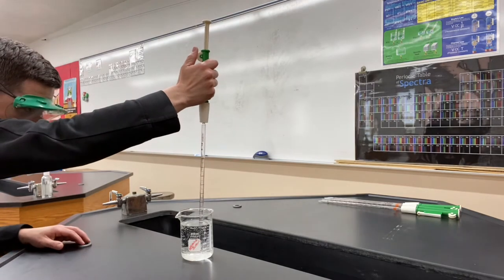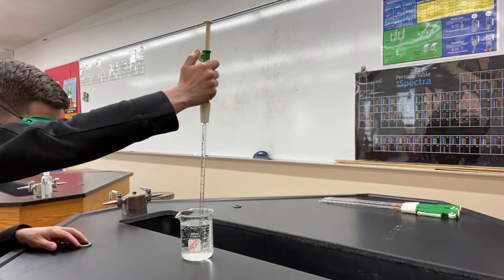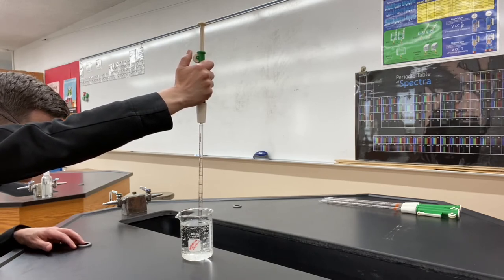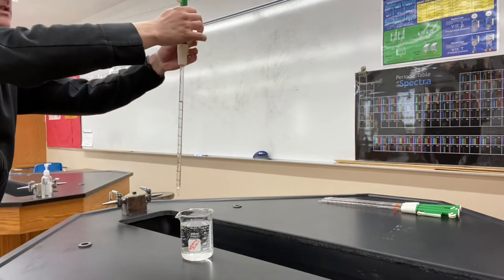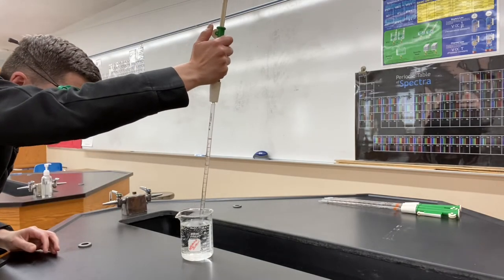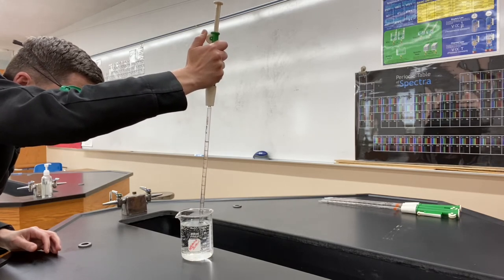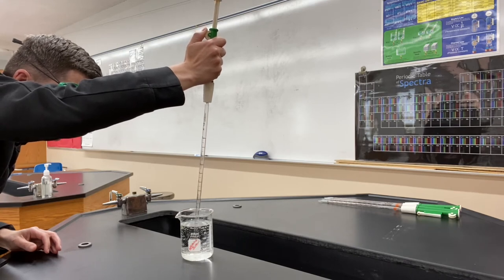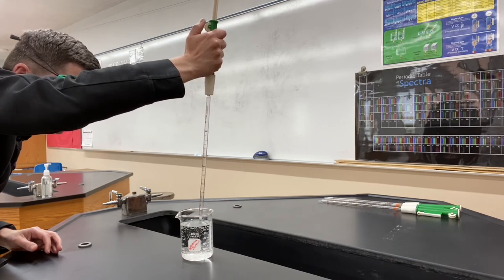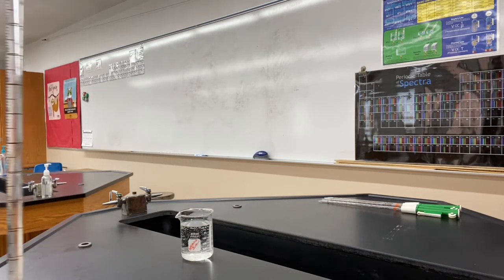And here I actually wanna get down to eye level and try to bring the meniscus right to the 0 mark. And I actually went past, and I can turn the wheel in the opposite direction to go back down to that mark. So I'm gonna try to bring this in so that you can see it. And actually it changed a little bit again. I got some drops coming out. That's okay. Go back. For some reason I'm just losing a little bit as I bring it out. That's pretty good. So hopefully you can see this.